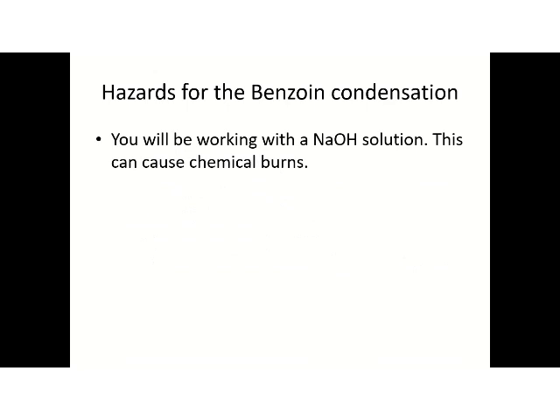Very important, you will be working with sodium hydroxide solution, which can cause chemical burns, which means that you need to be careful in this case to always use your protection: your gloves, your goggles, your lab coat, and be fully covered and protected. And at the end, the products or the waste from this reaction need to go into the proper waste container.